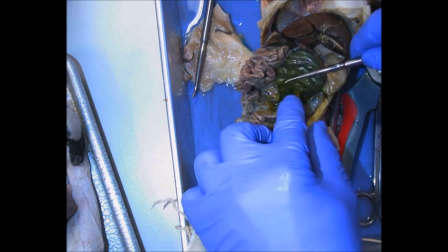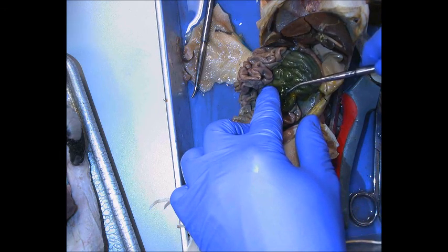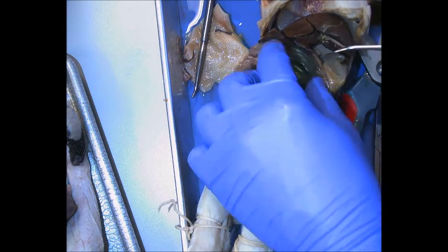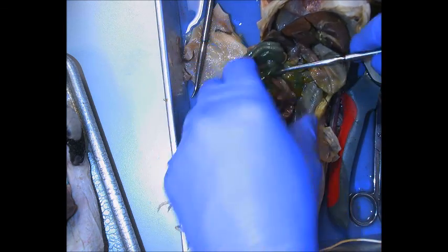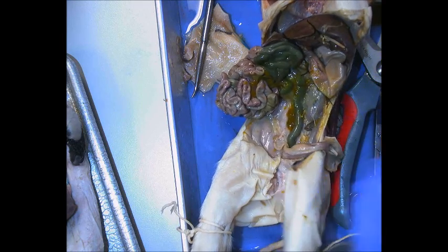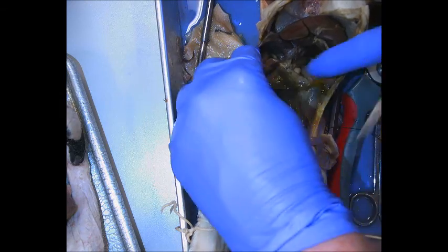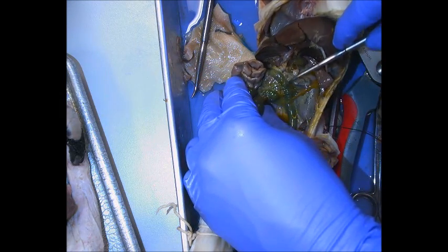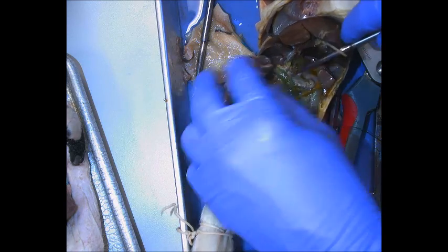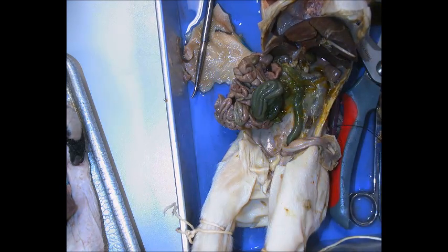Those little things sticking up right there form the ileocecal valve. That runs into the spiral colon, which eventually runs down into the rectum. The only other structure — that little bit of chewed-bubblegum-looking gray material — is the pancreas.